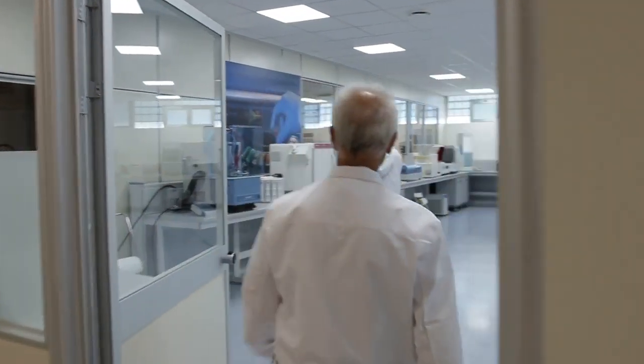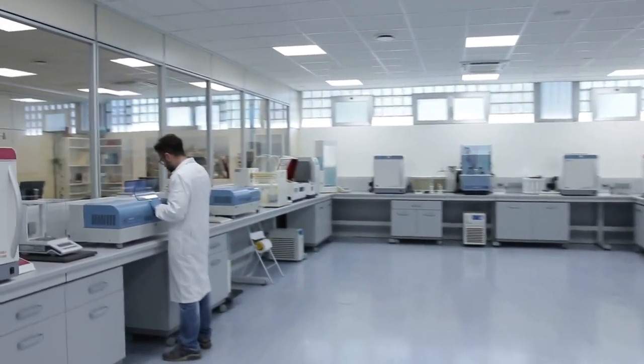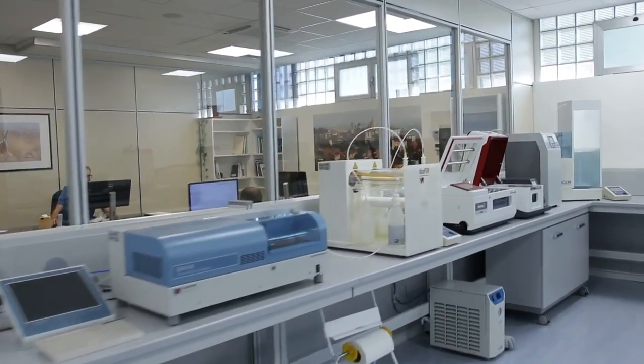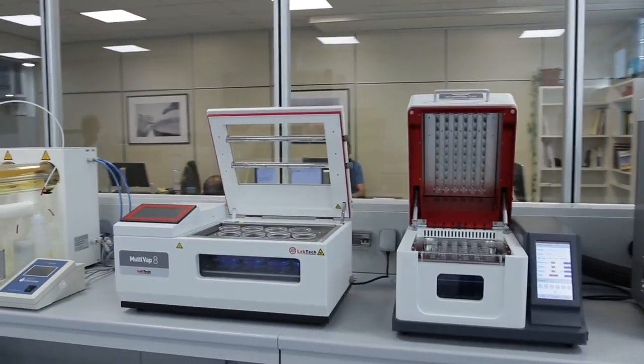Efficiency and precision are more and more requested in any kind of modern lab. Samples quality is a crucial issue for any kind of application, and Labtech's instruments can give an excellent contribution to their daily job.